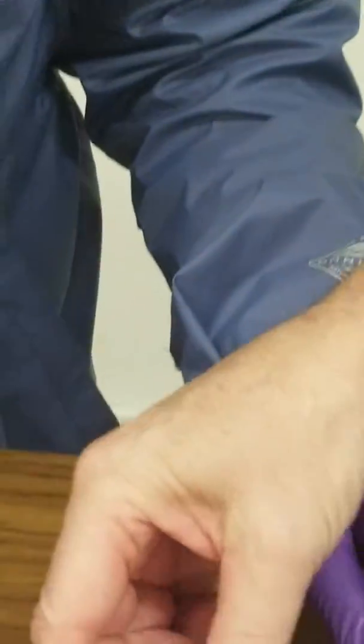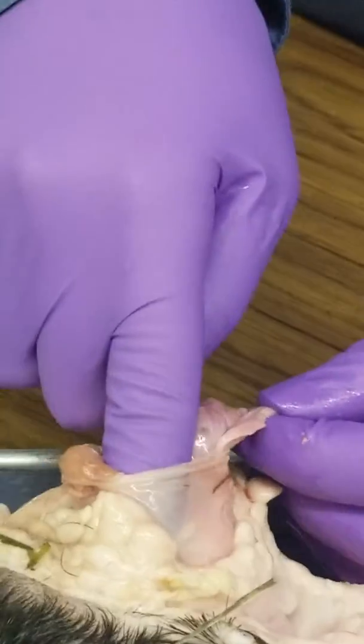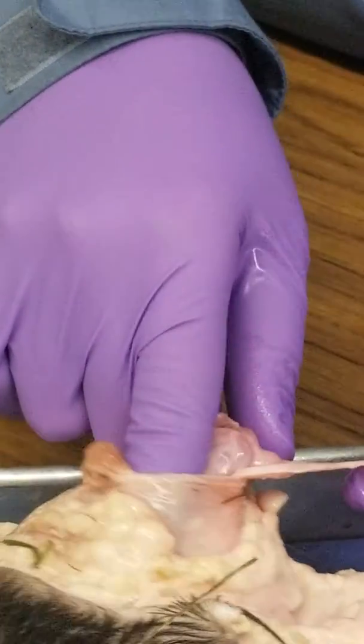And then the cremaster muscle is that thing right there — that one part. It's skeletal muscle. When we stuck our finger in here, touching down here, this is the tunica albuginea.